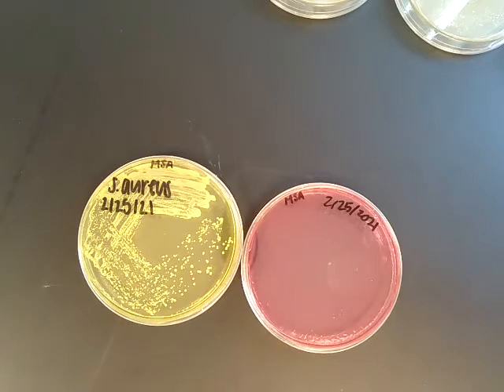identification of staph-related species. So, staph-related species tend to grow on the skin where we have a high salt concentration, so they can handle a lot of salt. Not many other organisms can handle that amount of salt. So the high salt concentration in here selects against the growth of most other organisms.